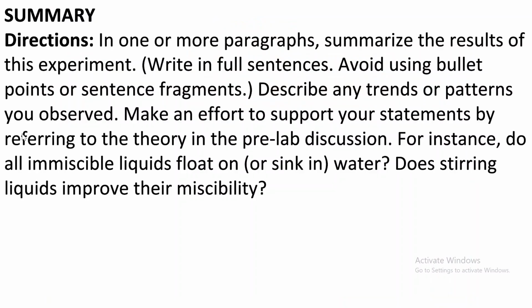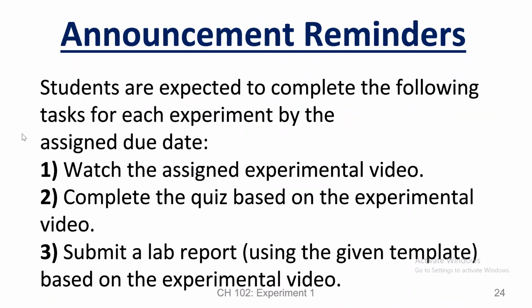Make sure to describe trends. Make an effort to support your statements by referring to the theory in the pre lab discussion and the theory that we discussed during the video. For instance, do all immiscible liquids float on water, or do they sink in water? Does stirring liquids improve their miscibility? These are some questions that you need to be addressing in your final summary, which you'll find at the very last part of your lab report.